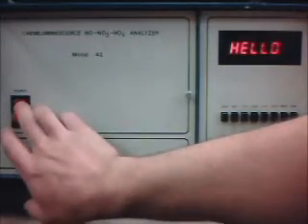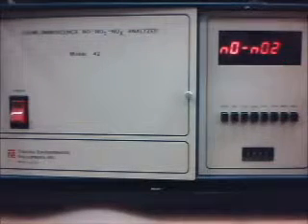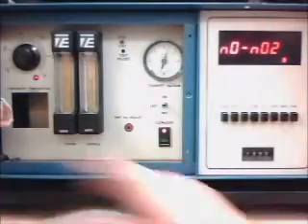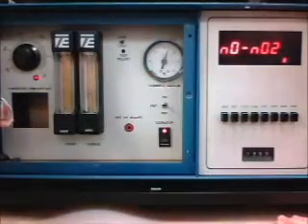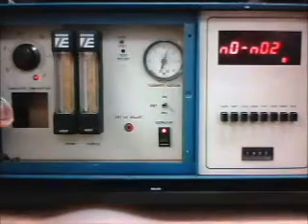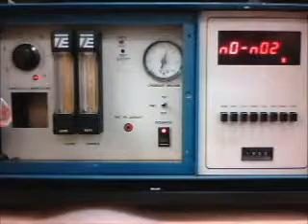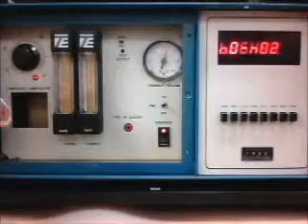So when we turn it on, we see that it says hello, just like it's supposed to according to the manual, and then it's going into an NO and NO2 run mode, which is just the basic auto run that it goes into after startup. If we open this up, we can see that the chamber vacuum pressure is reading roughly 17 inches of mercury. The converter temperature here is set to 325 degrees. I don't know if you can see that. The video quality isn't the best.